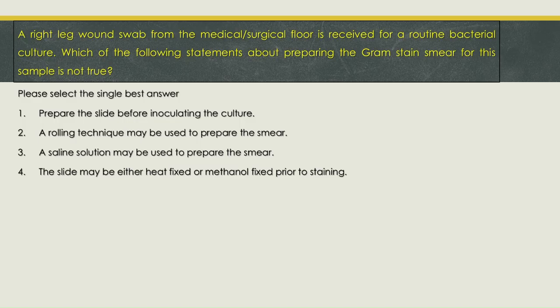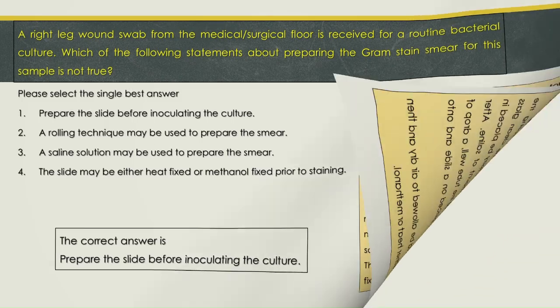1. Prepare the slide before inoculating the culture. 2. A rolling technique may be used to prepare the smear. 3. A saline solution may be used to prepare the smear. 4. The slide may be either heat fixed or methanol fixed prior to staining. The correct answer.